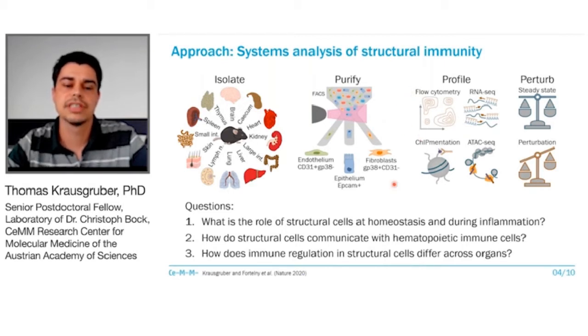However, I was also interested in how immune regulation in structural cells would differ across organs. And here I used the data from chipmentation and ATAC-seq experiments to really find out which transcription factors ultimately implement organ-specific and cell type-specific immune functions in structural cells.